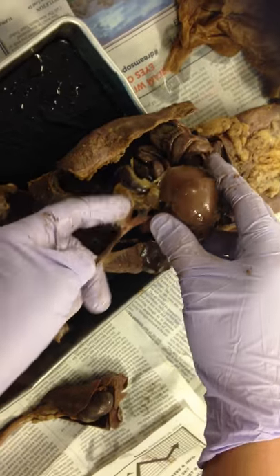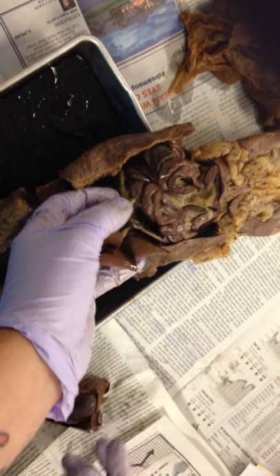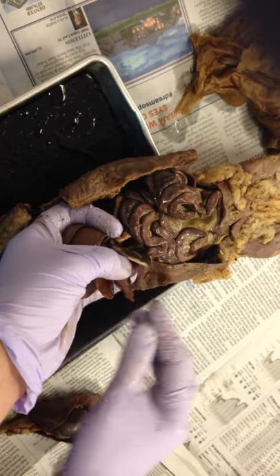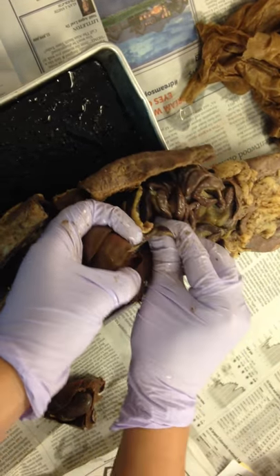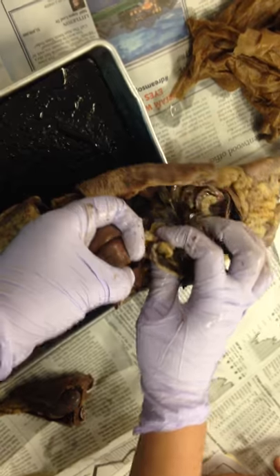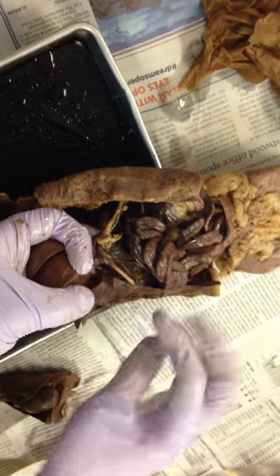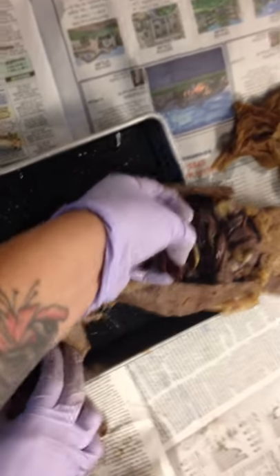That way I can figure out, okay, my esophagus is here. I'm trapping it under these fingers, and I'm going to hold it like this and tilt it up. When I tilt it up, that allows me to see, okay, I've got some intestine right here, and I've got all this connective tissue right here. But I know none of this connective tissue and none of these blood vessels are esophagus, because I've got my esophagus trapped underneath my finger.